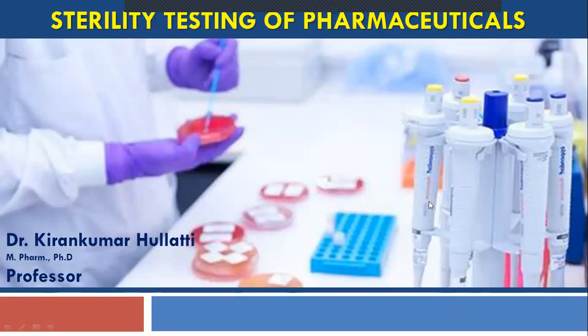So now during testing, the media in which we are going to place this sample to see whether the organisms are present or not, and if they are present, whether they will grow or not. In such a case, if the media is not proper and doesn't support the growth of those weak and very few organisms, definitely you are going to get a negative test. That means the sterility test passes. But in fact, there will be some organisms remaining, which might not have grown during the testing period. So this is what we call a false negative report.